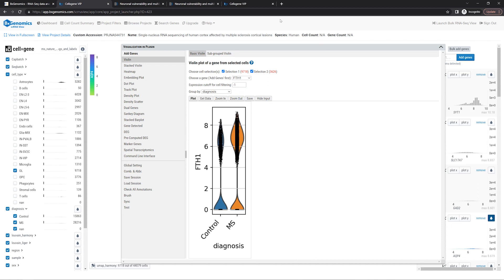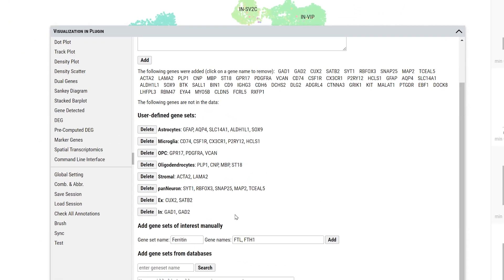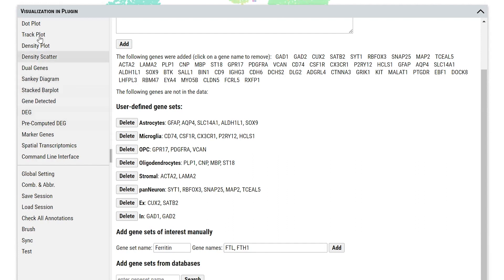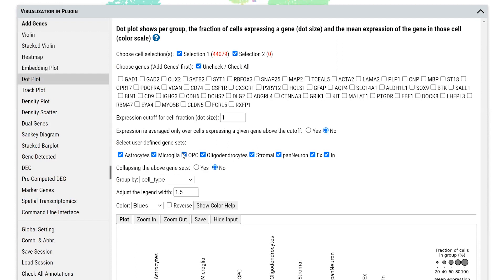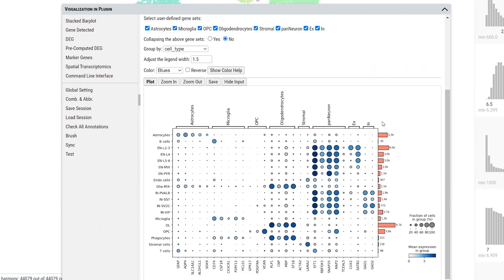Lastly, we're going to demonstrate another very useful feature of VIP: the dot plot. To save time, we loaded a saved session to add marker gene sets for eight cell types. Users can also manually add new gene sets. Go to dot plot, choose the gene sets to plot, and group data by cell type. In the dot plot, each row is a cell type and each column is a gene, organized by marker gene sets. Here we can see that astrocyte marker genes are indeed mostly highly expressed in astrocytes, pan-neuron markers are expressed in all neurons, while excitatory and inhibitory neuron markers can help divide the two major neuronal types.